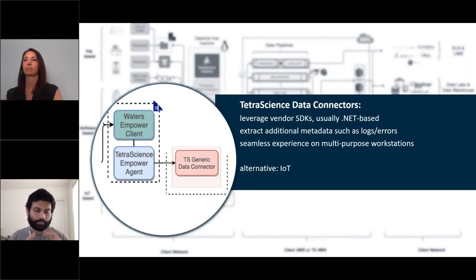Now, I focus here heavily on the approach where we install an agent onto a computer connected to an instrument, but there's a whole other path where we use IoT approaches, where we put a physical TetraScience device connected to a port on the instrument and extract data that way. We won't talk more about that, but just something to keep in mind.